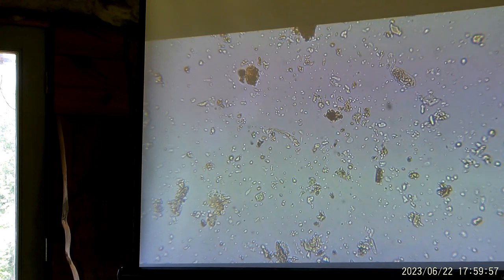Now, there's a thing called Brownian motion. Just because they're moving around doesn't mean they're actually alive or active. And so whenever you're seeing movement, don't mix that up with something that's alive or active. It could just be a simple effect of Brownian motion. You'll see when these microbes want to move because they move very intentionally. And hopefully you can find one that is actually moving other than the bacteria that are here.